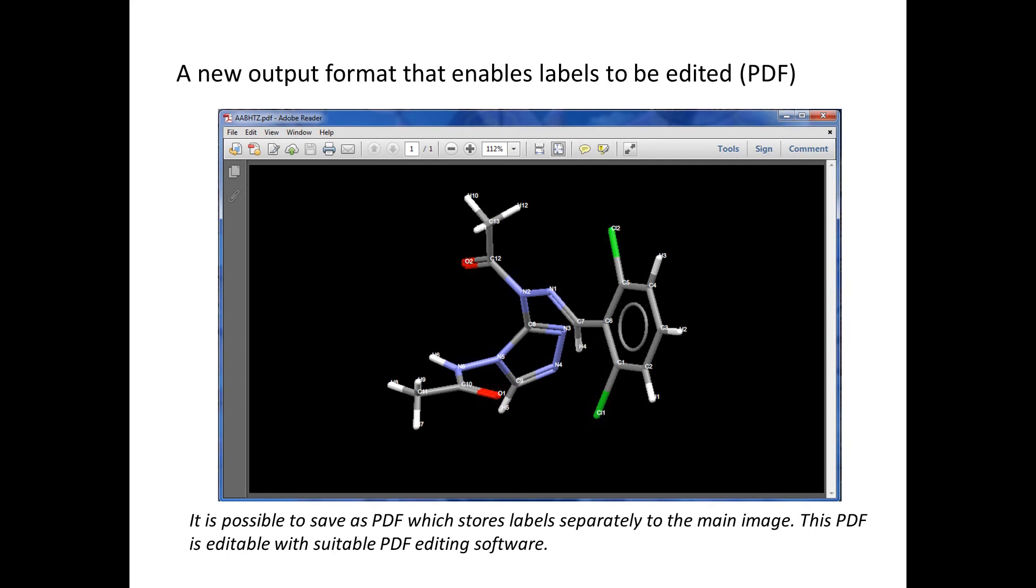We have also introduced a new output format that enables these labels to be edited. Saving in the PDF format, if you have the correct software that enables you to edit PDF documents, you will then be able to edit the labels.